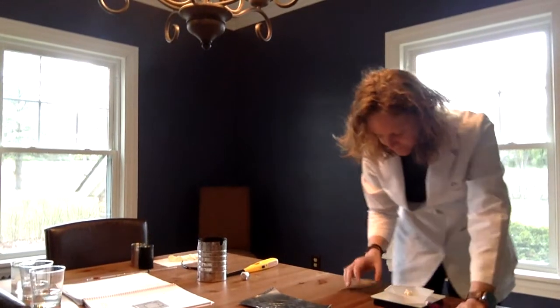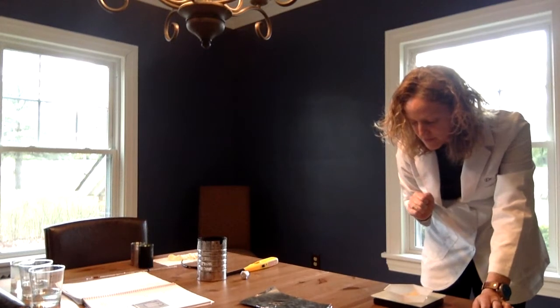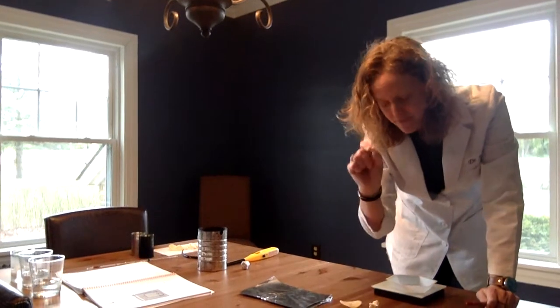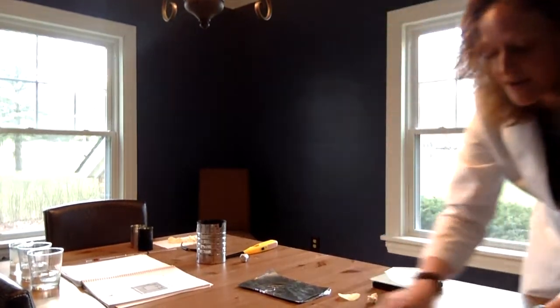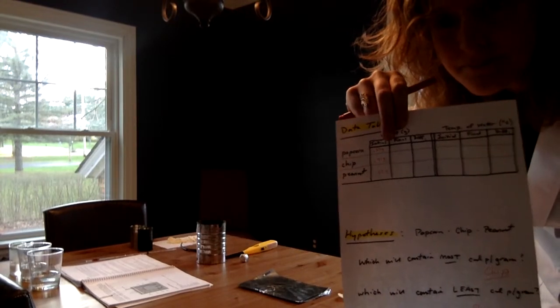Potato chip — I'm going to zero it again. Potato chip: 0.41 grams. Isn't it fun to do science? In what other lab are they going to be burning up food? Now we'll do the peanut: 0.53 grams. So we have the initial food weights. After we burn the food, we're going to weigh them again to get the final weights, and then we're going to take the difference.